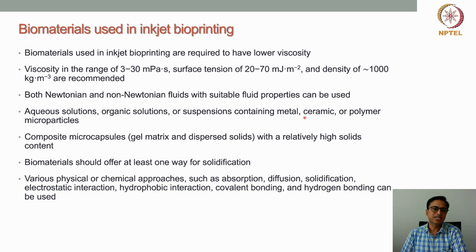Similarly, in certain cases, a few researchers have also used composite microcapsules like gel matrix and dispersed solids with a relatively high solid content. So a few researchers have also shown the capability of using this kind of material for inkjet 3D printing.